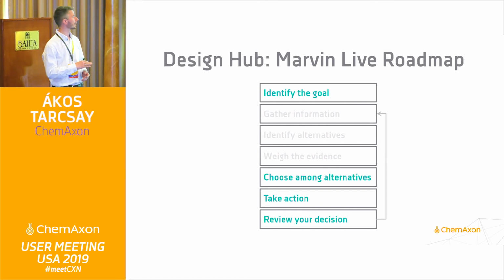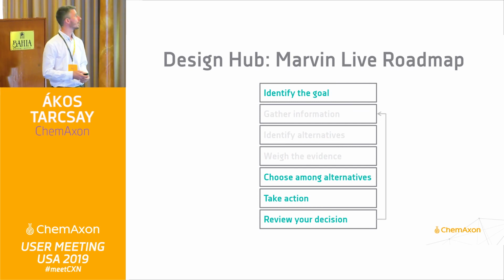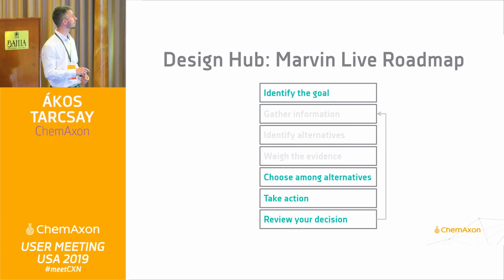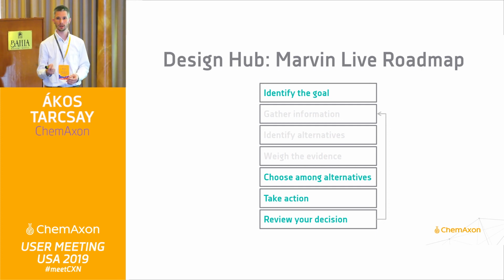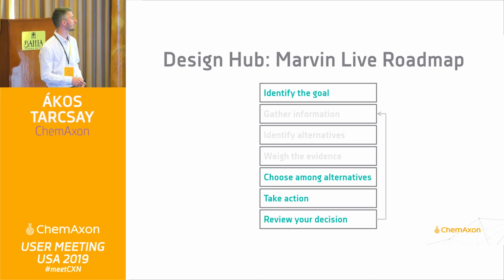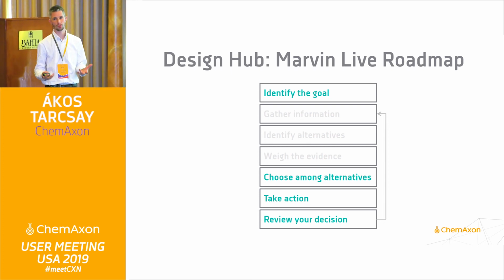And just one slide, and please reach out to András Stracz for the details about where Marvin Live is going. It's about hypothesis management, about better capturing the scientific rationale you are actually working with in a design space, and being able to better support the review process and decision making, even in a multi-project context.